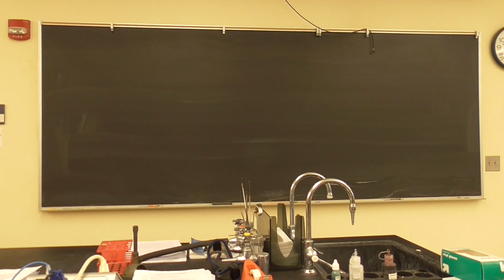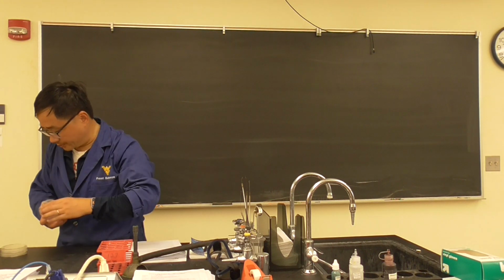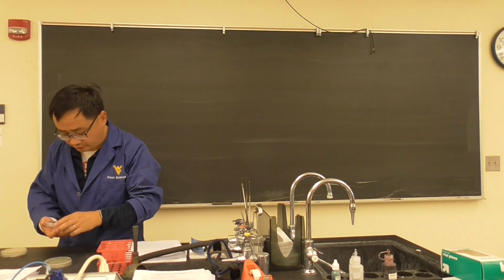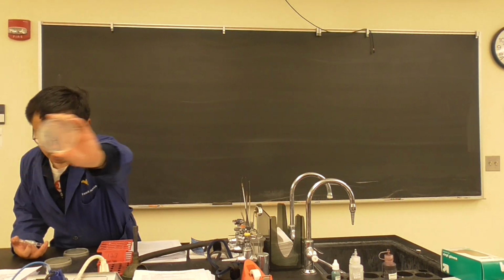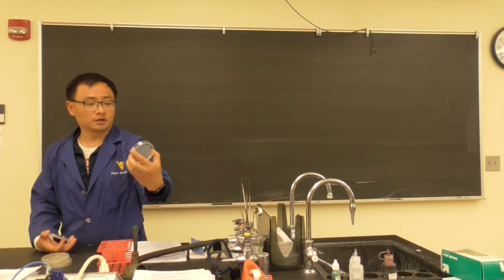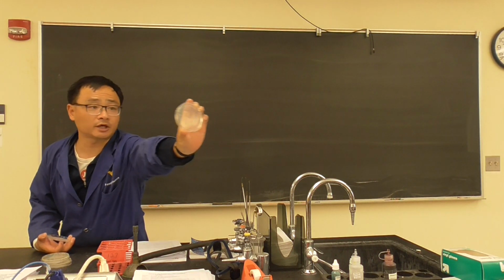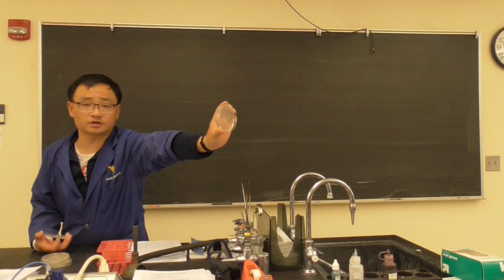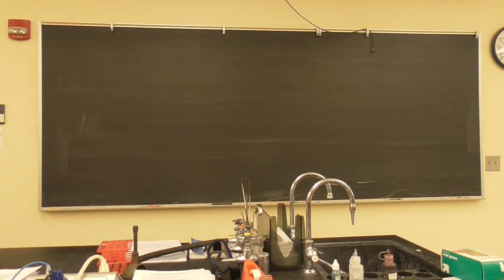We can take a look at another example. We can see 10 to the power of 3, it's messy, but it's very evenly distributed. This 10 to the power of 5, you see a lot, and this one looks very good. You see the large ones on the surface and the medium ones in the middle and some tiny ones. And this one definitely is countable. Okay, so that's a good example for plating.